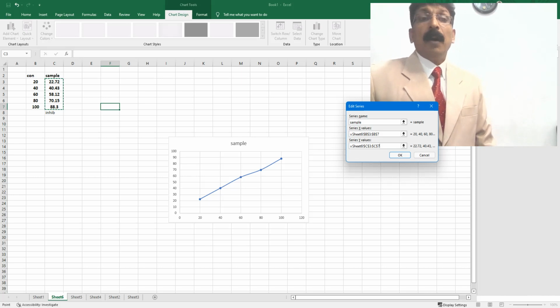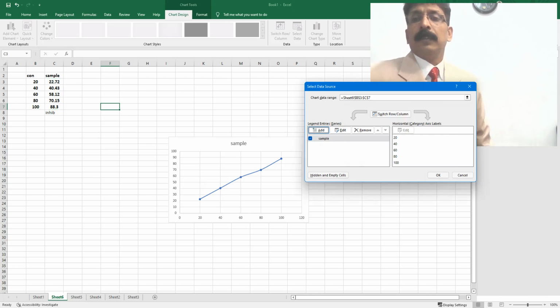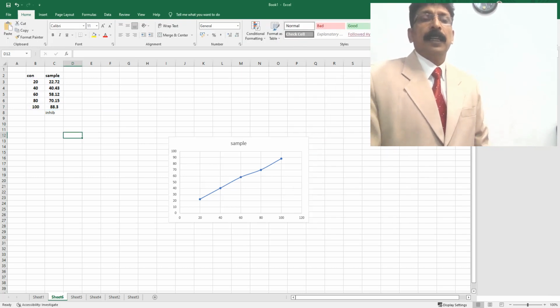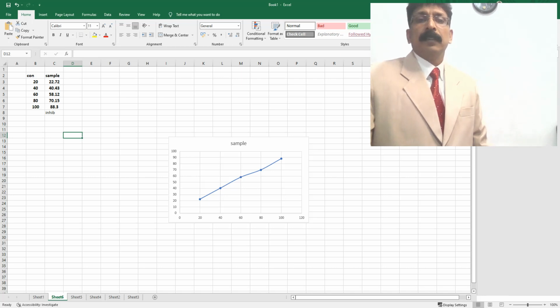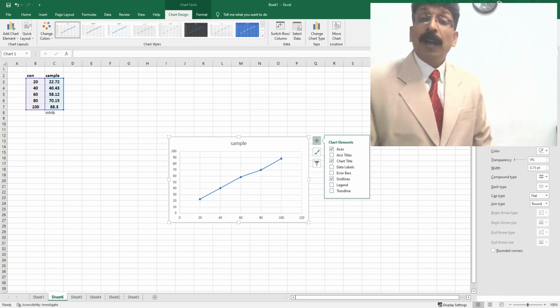And now still more work is there. The line equation you want to find out. So you put OK here and then go back to the place. Here you can click and release it. And now keep the cursor here, click Add. What should you add?